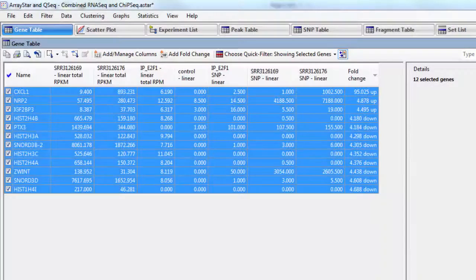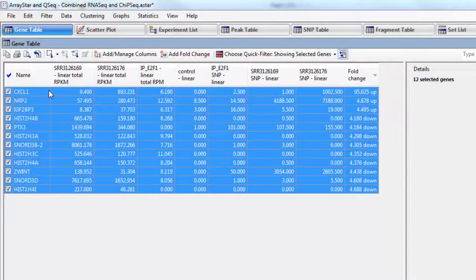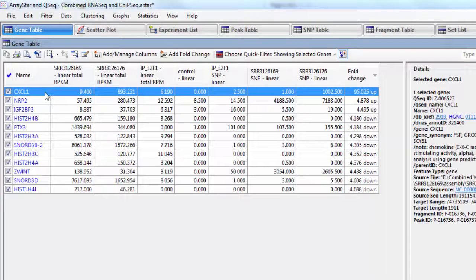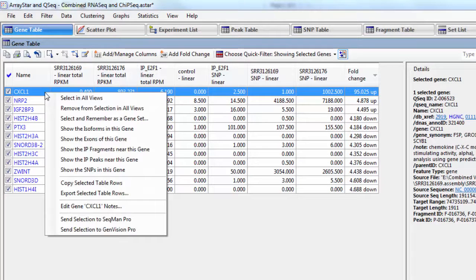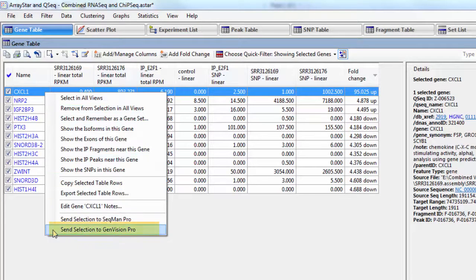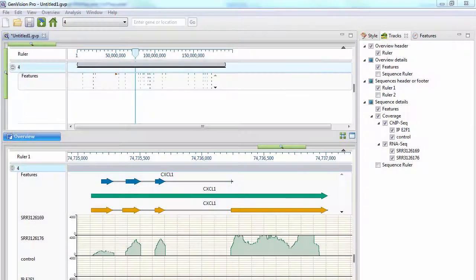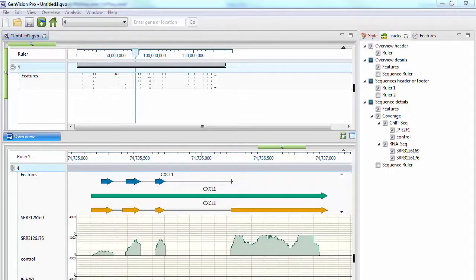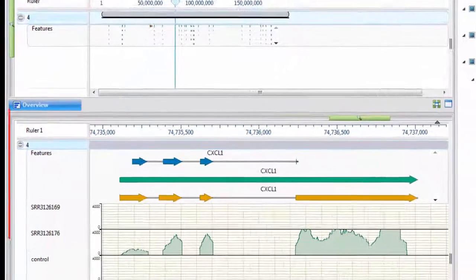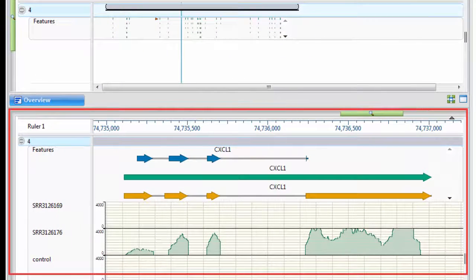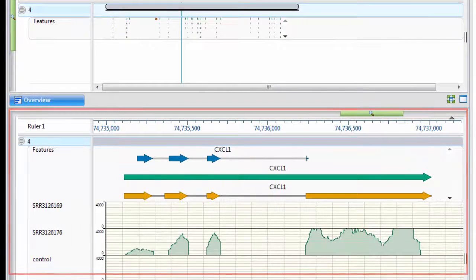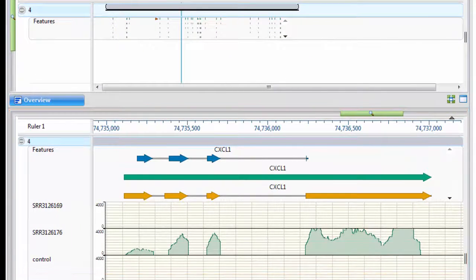To visualize this data, I'll select the gene, right-click on it, and choose Send Selection to GenVision Pro. And that will open up GenVision Pro, our genome visualization software, and it will automatically open to the gene I had selected in ArrayStar.